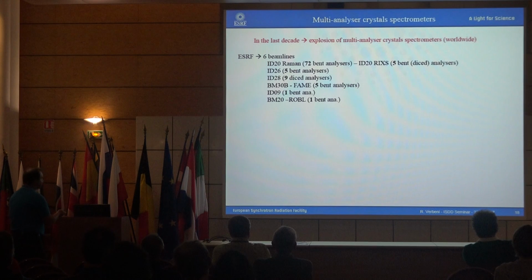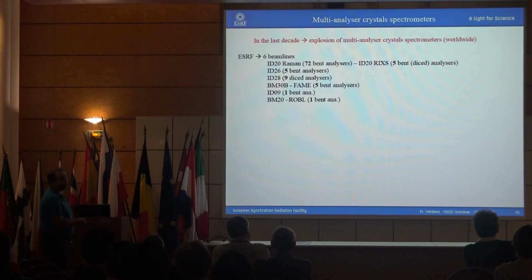So, as Claudia said at the beginning, in the last decade, we saw an explosion of these multi-analyzer spectrometers. We have spectrometers being built in all parts of the world, and all of these are multi-analyzer crystal spectrometers, and they continue asking for analyzers of all kinds of types.